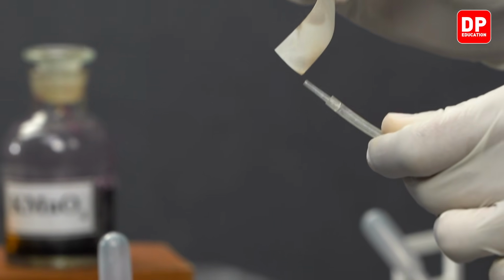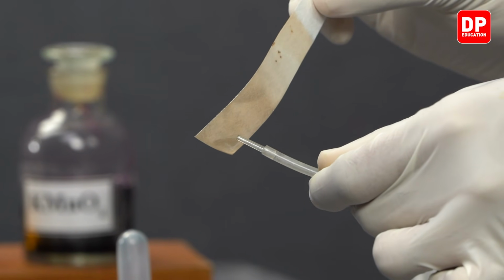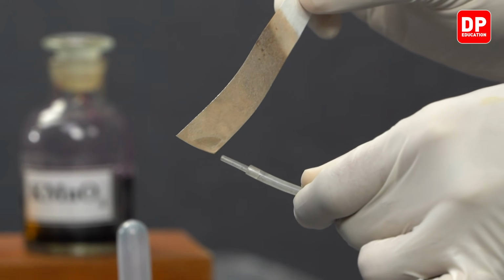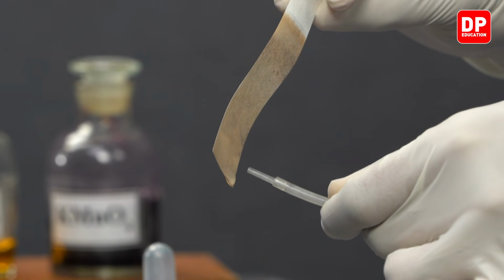You will observe, as we send the hydrogen sulfide gas, this paper soaked in lead acetate turn to a black color.